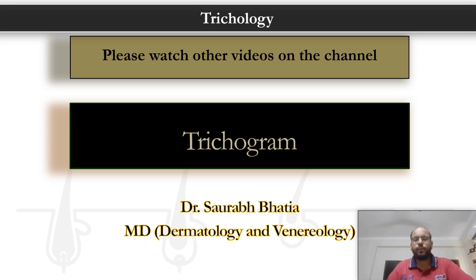Before you see this video, I would request that you go back and see all the related videos on hair. You should see the hair histology, the hair growth and cycle, hair anatomy and physiology, so that you can understand what layers are present in the telogen phase, and what layers are present in the anagen and the catagen phase. If you know what layers are present in different stages of the hair cycle, you can easily understand why telogen hair has a crumpled sock appearance on trichogram and why you have a hockey stick appearance in anagen hair. You can understand all of these morphological features when you know the anatomical constraints of that particular hair in that particular stage of the cycle.